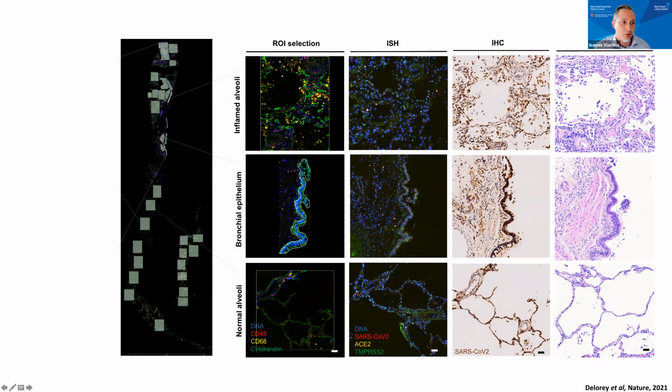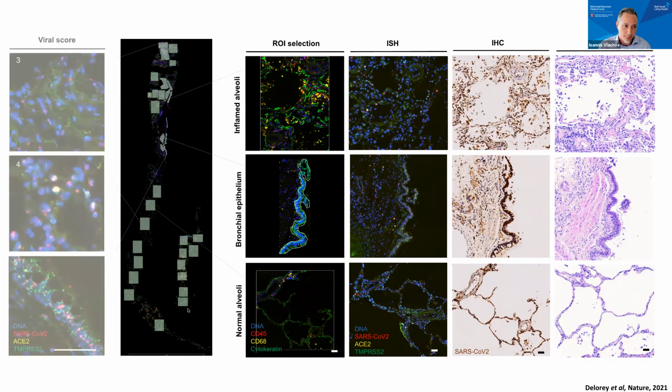And that is important to show that you can use circles, as we saw on the NanoString slide. You can use squares, rectangles, but you can also do freeform. There are other ways to do it, and I will show more on different organs. And for instance, this is a bronchial epithelium selection. Your regions are usually 50 cells and up. I think officially it's 200 cells and above, but for us it works for 50 and above. You can get a very nice representation, and you get whole transcriptome for those.